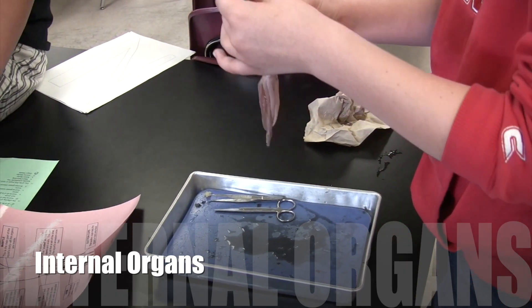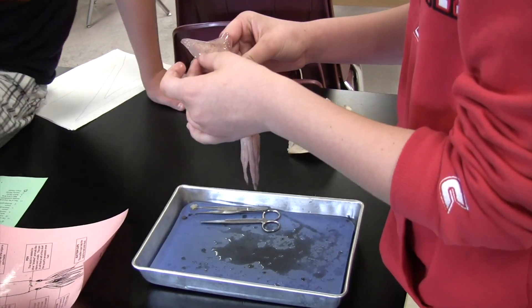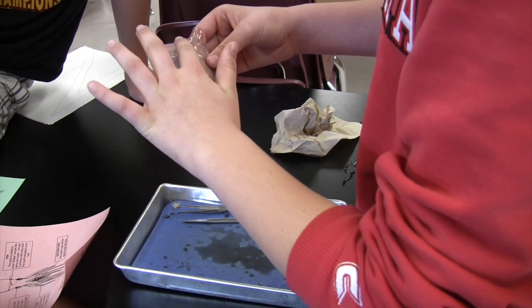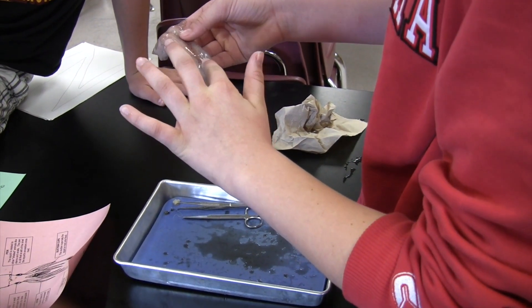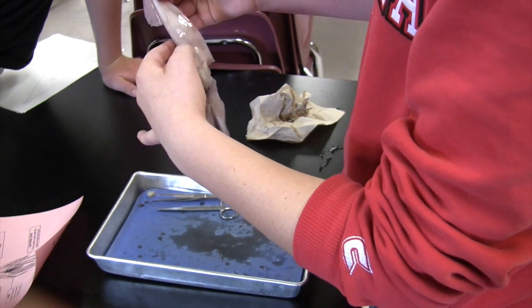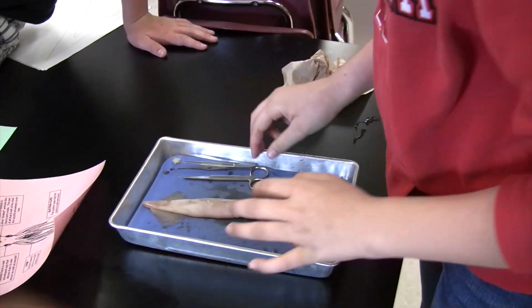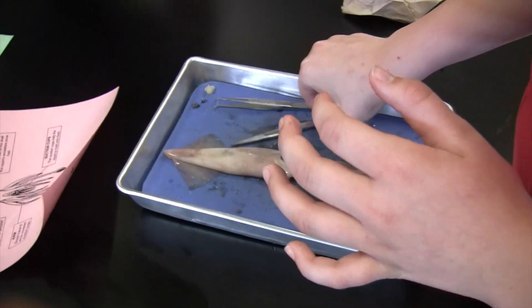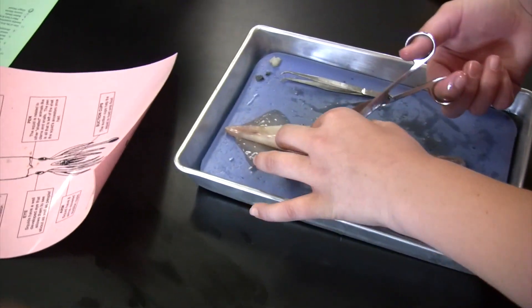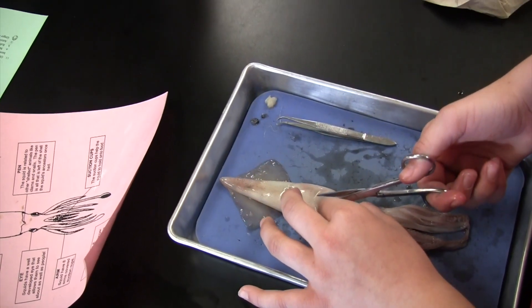So this is the squid, and I'm going to be cutting into it to show you the insides. This is the back because it's black and darker, and then the front is lighter. When you cut into it, you want to put it on its back, so the dark side down. Then you grab your scissors and lift up this part. You don't want to cut too deep because it'll cut all the insides and guts.